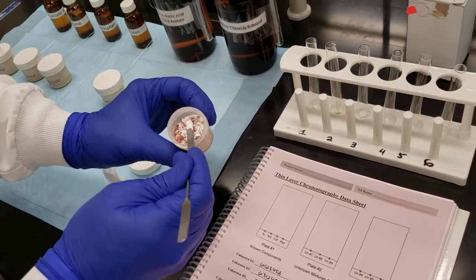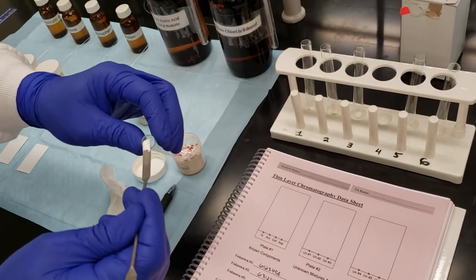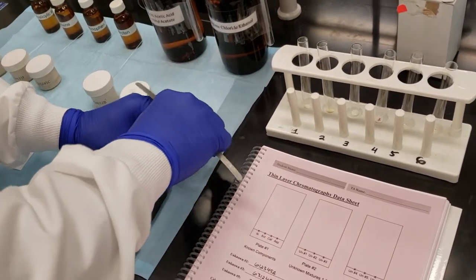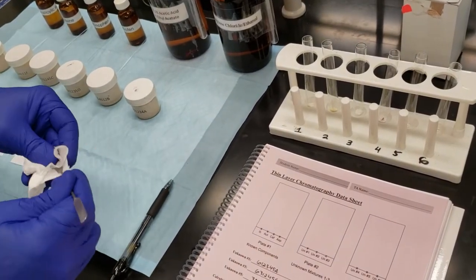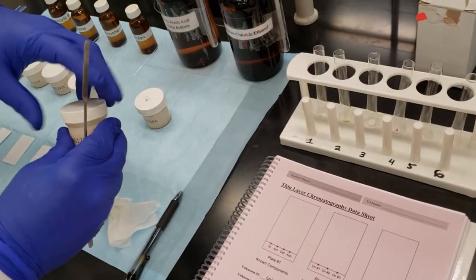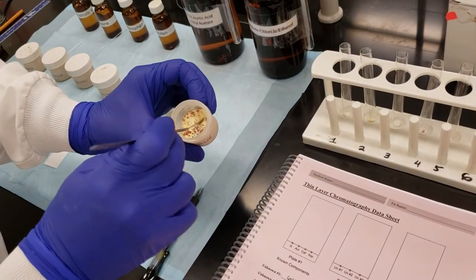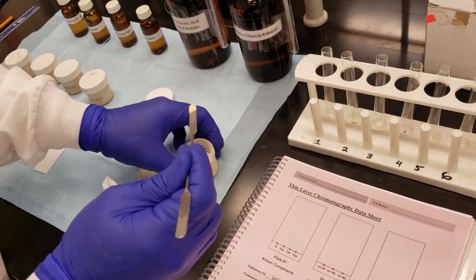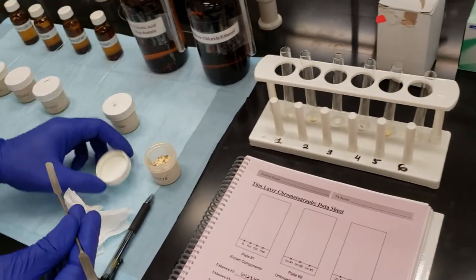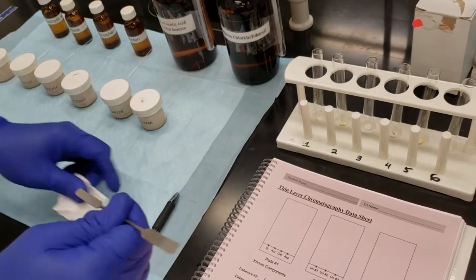So we'll get a little bit of that powder. If you get some of the peel or some of the outer coating into your test tube, it will most likely not dissolve, but that's okay. You just need enough powder to make a spotting solution. So that's number four. Number five. You can see a little bit of that same outer casing. And then finally, number six.